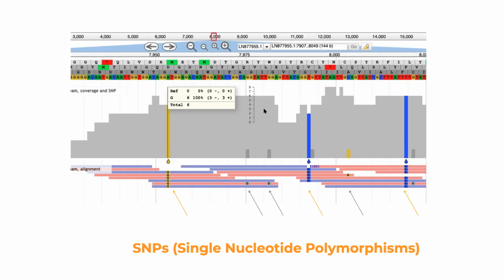So what are those plus minus? So what is the total number that is different? It's 6, right? But why don't we have 3- and 3+? Okay, the answer is, as you can count the reads, 3 are blue, right? And 3 are red. What do you think are the red and the blue?